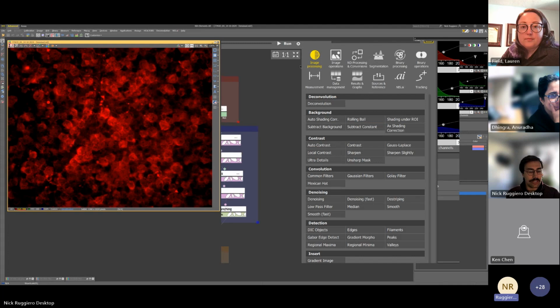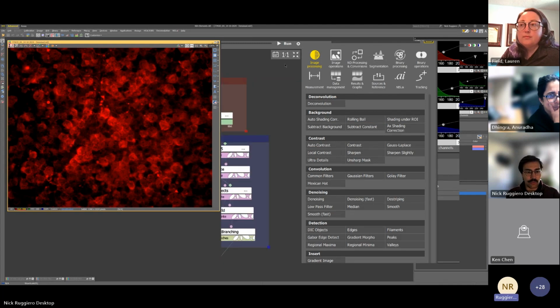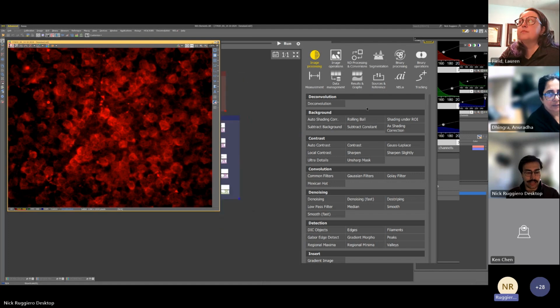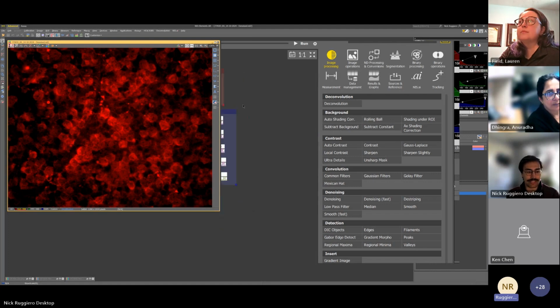The other thing to note is that we can scroll, we can zoom in, we can focus on things. You'll notice I can make little sections here so that all my functions live in one box that I can navigate more easily. Also, as you can see, I've tried to break these down into those 3 main sections we talked about, where I do all my pre-processing and then I work on my binary layers and get all the information I want from those. And then at the bottom, I do all my records and get all my tables together and any graphs that I want.